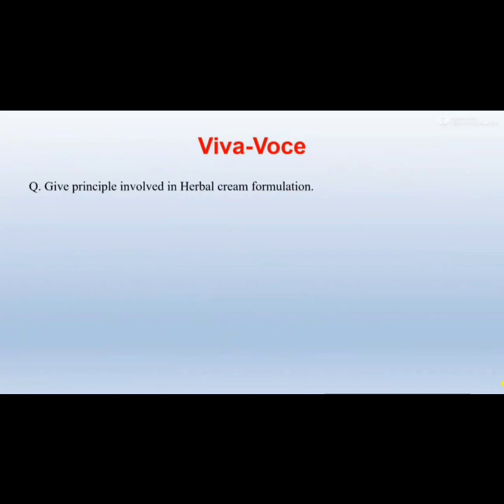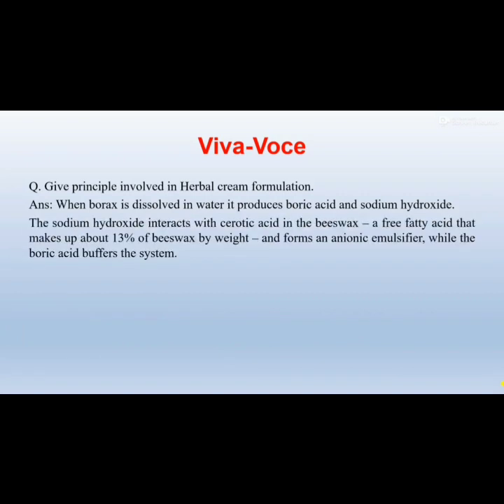Give the principle involved in herbal cream formulation. When borax is dissolved in water, it produces boric acid and sodium hydroxide.